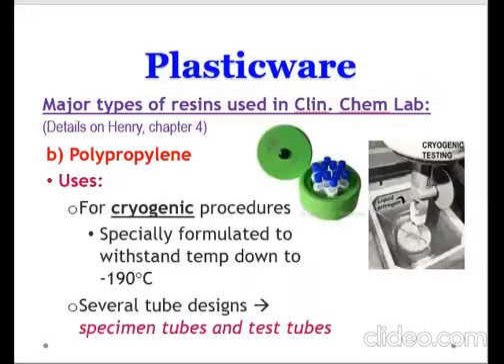So what are the uses of polypropylene aside from being one of the components of your pipette tips? Another use for your polypropylene is that it can be used for cryogenic procedures. I think you're familiar with the term cryogenic because you have already encountered that term in histopathology.